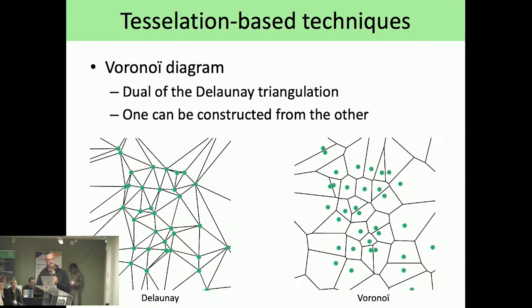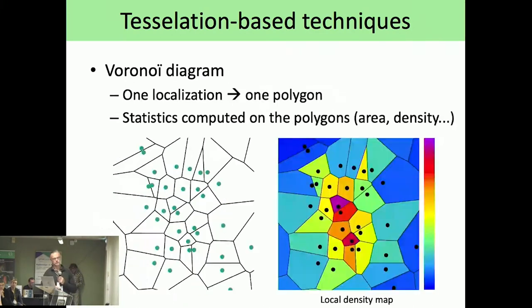And because they are connected, it's very easy to navigate here, and this is again the work of Florian, to have a real structure which is very efficient to navigate in a neighborhood and to use this as a quantitative measurement to do the segmentation. So at the end you can make different types of reconstruction, and then you can reconstruct images as well. So it's very nice.